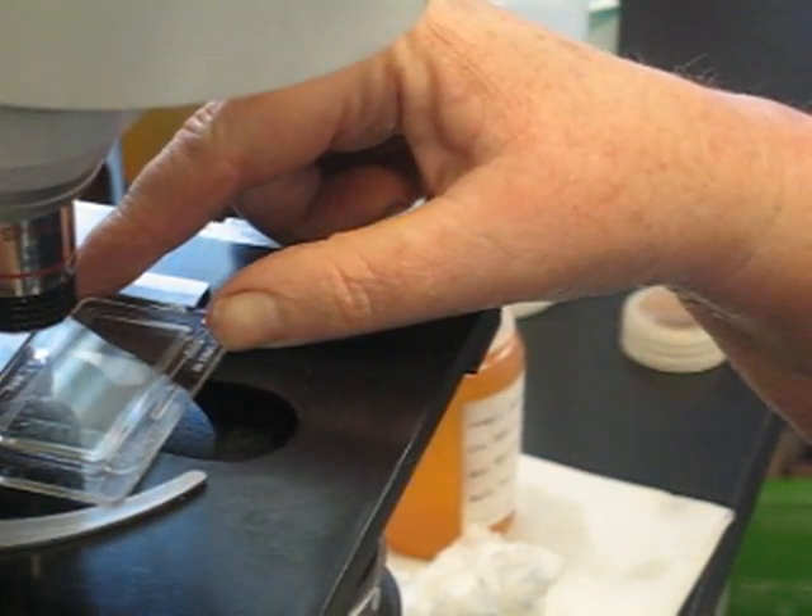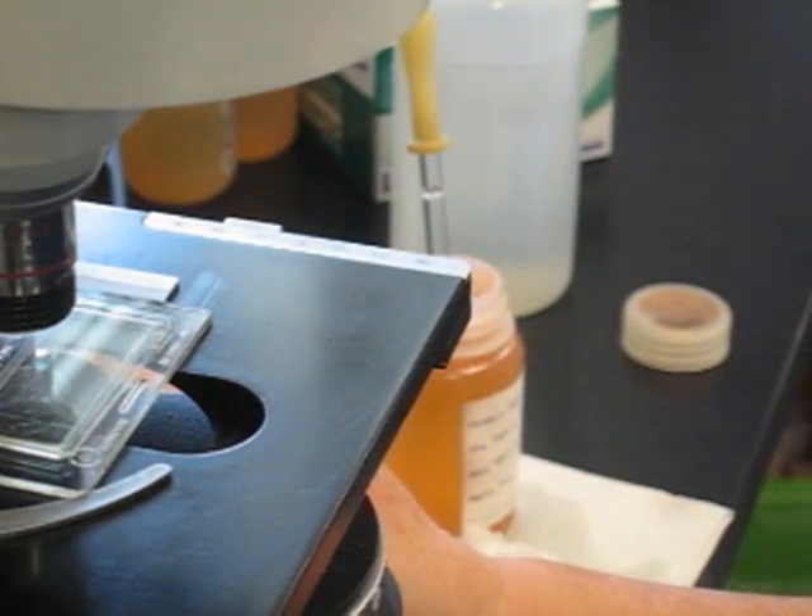Put it on the microscope to settle for three to five minutes — that allows most of the sample to settle out, and then you can scan it and see everything that's there.